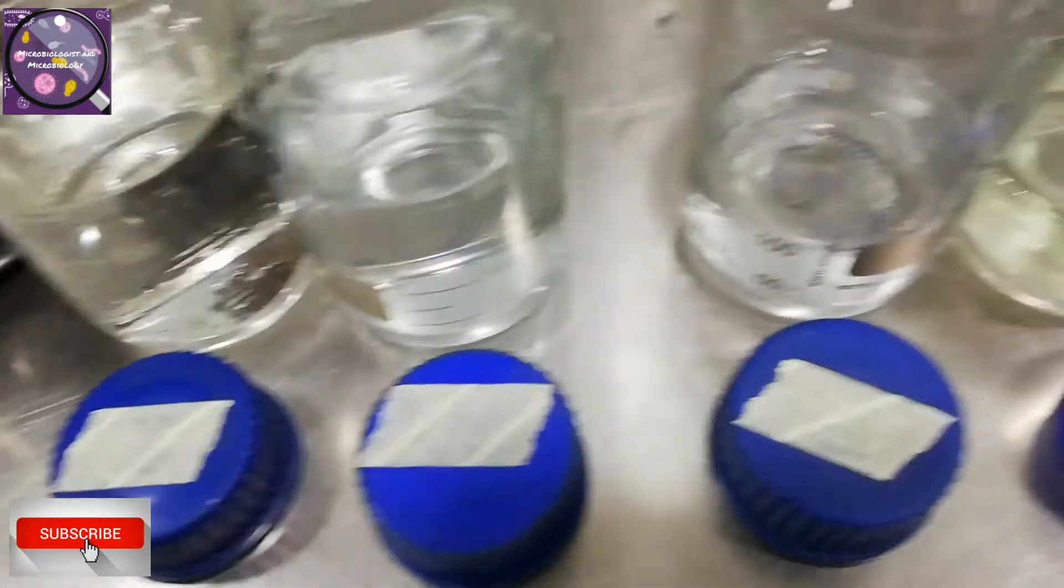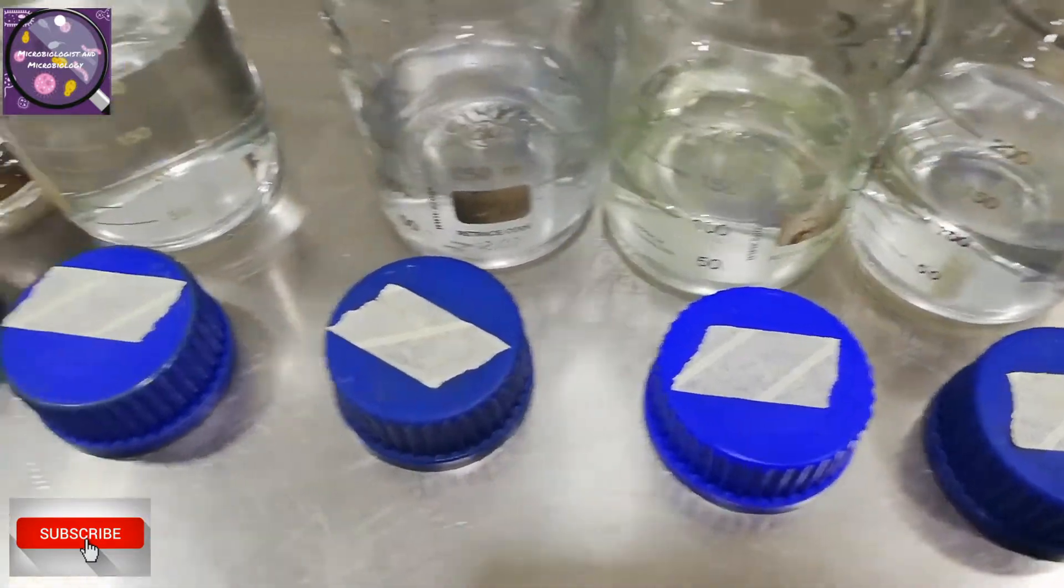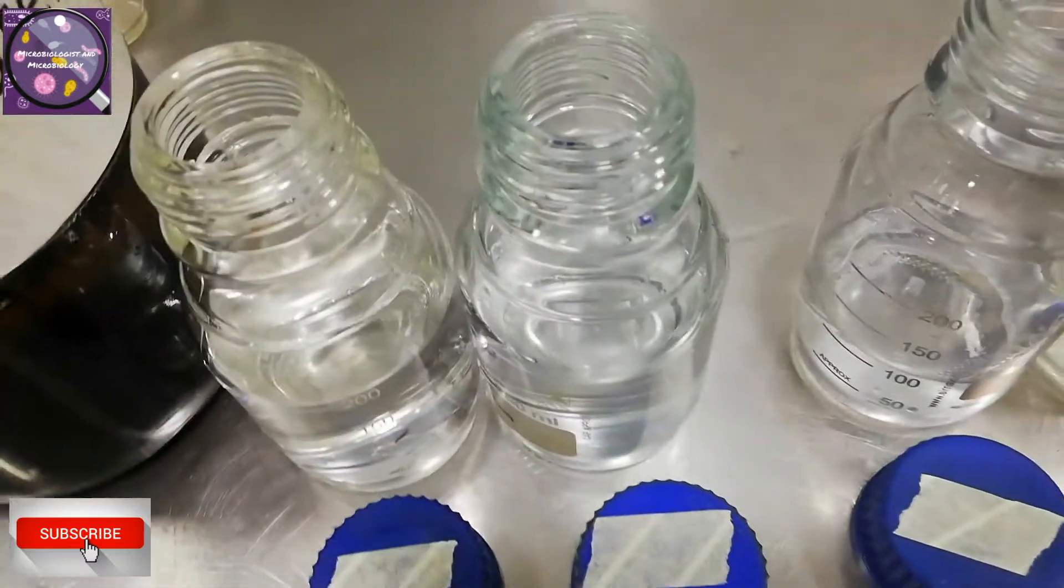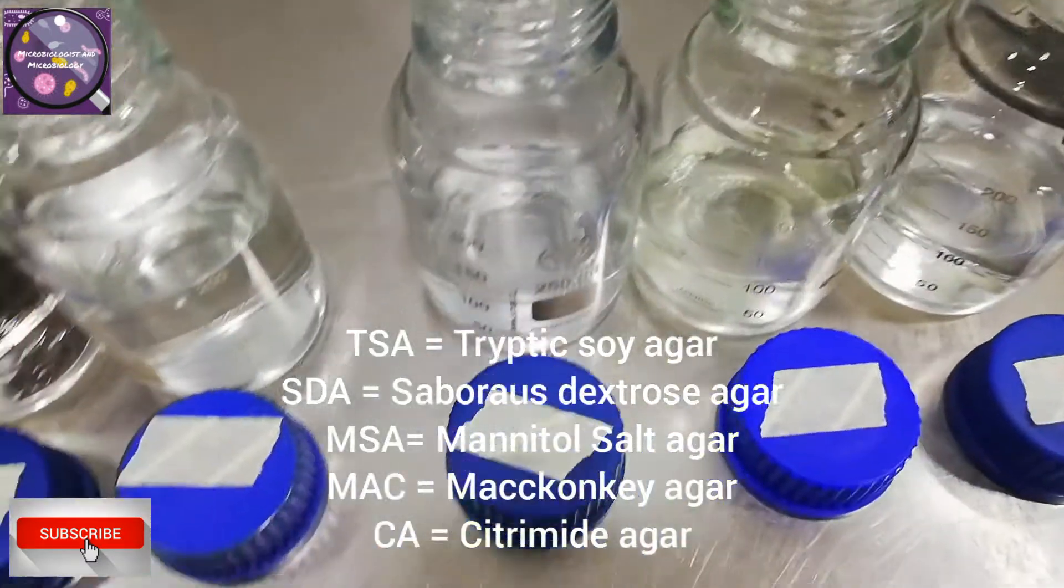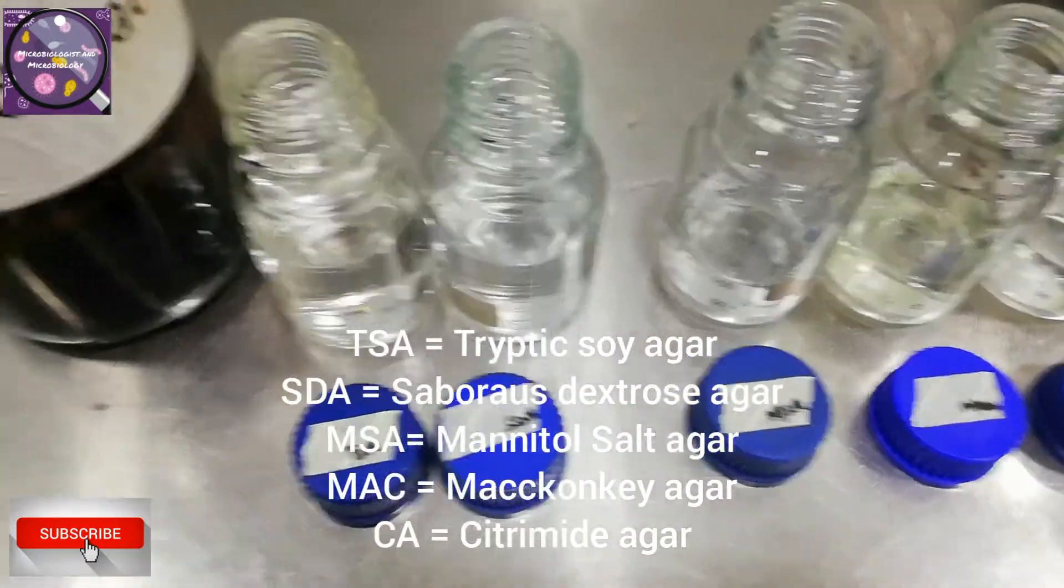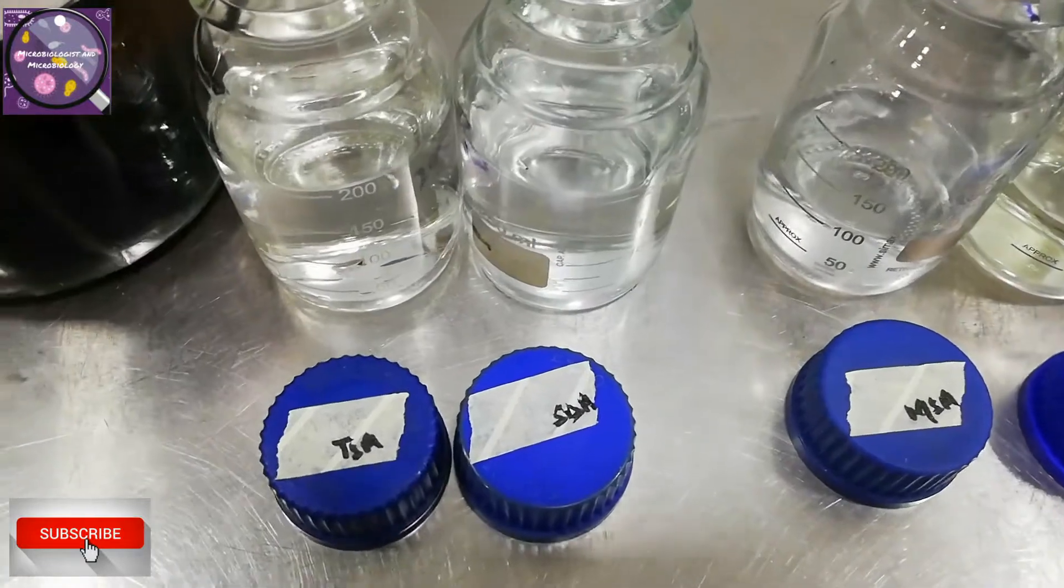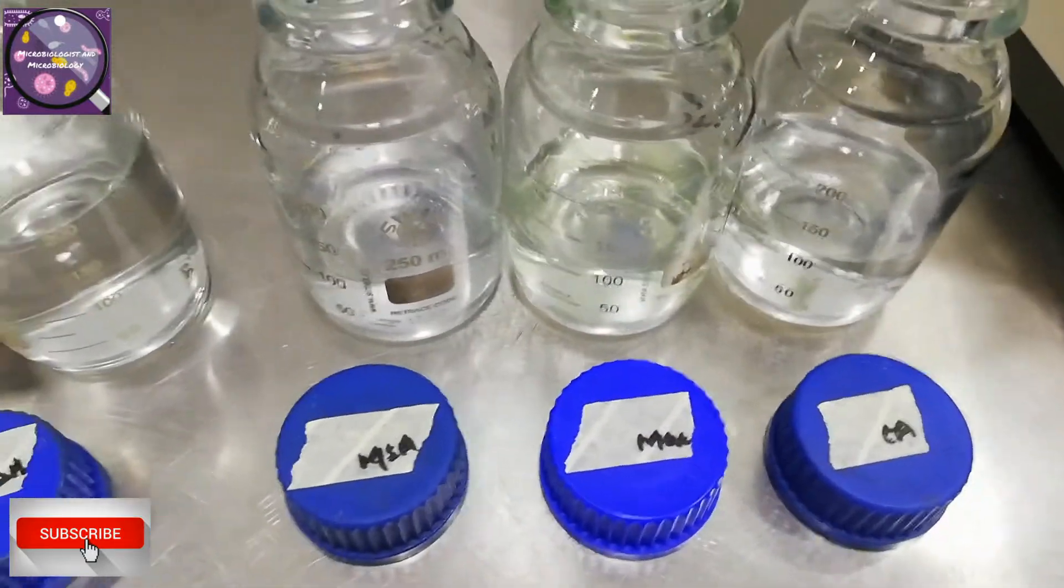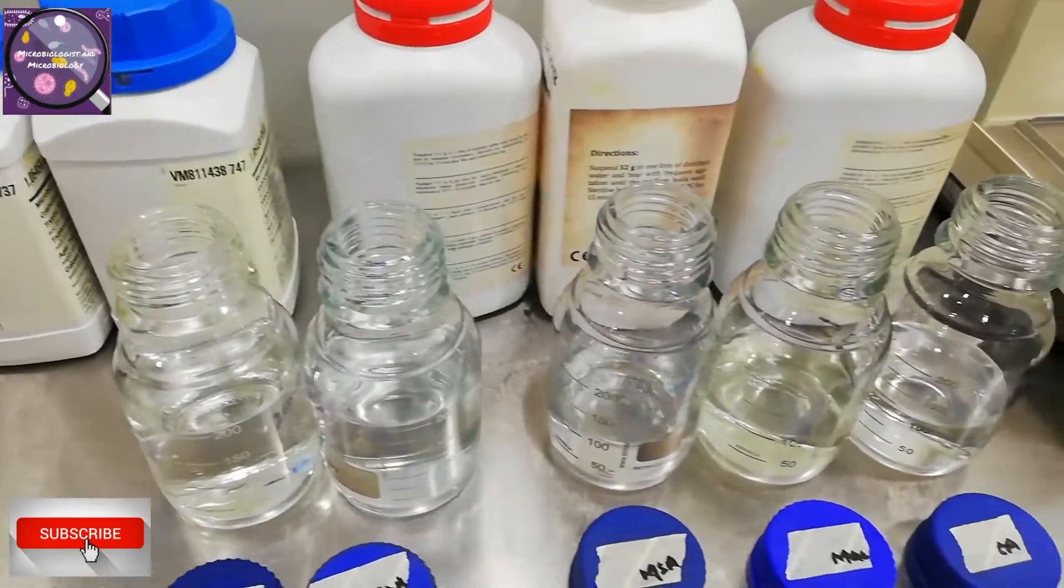Now I placed or stick the tape on cap. This tape is autoclave tape and it will change its color after sterilization cycle. I am writing down the codes of media. You can see the codes for particular media on screen. Here are the codes for each media on cap. Let's start measuring dehydrated media through weighing balance. The weighing balance is verified for the day.